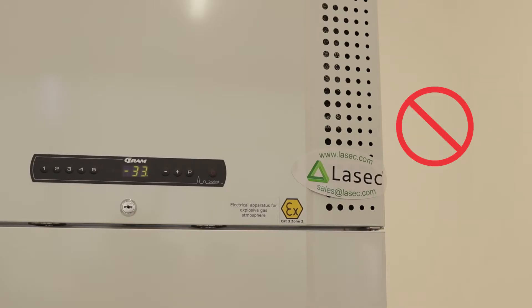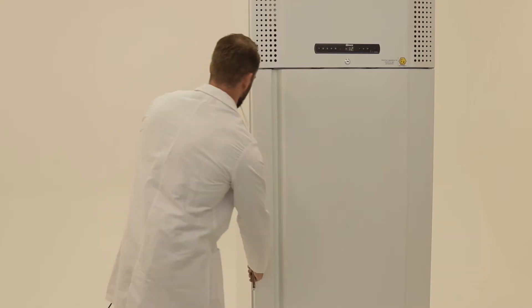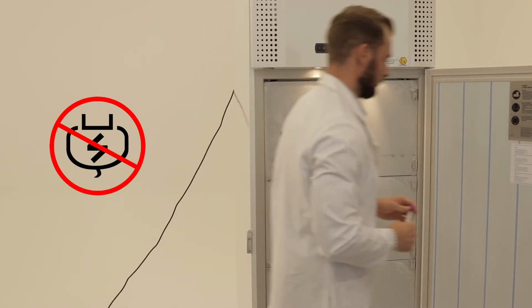It is also important to ensure that the holes in the front of the cabinet are not covered. No matter what samples are stored in the cabinet, it is important that no electrical appliances are being used inside of the cabinet while it is functioning.